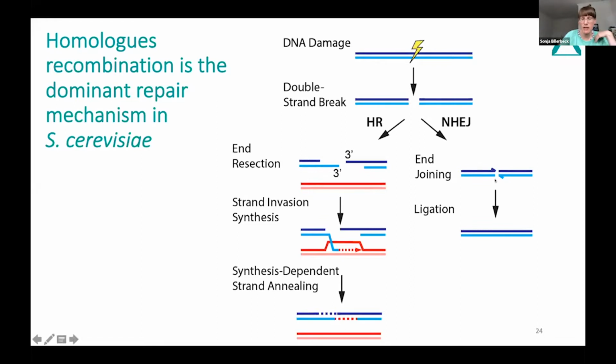And this is of course depicted here in the context of a genomic DNA recombination event. But we can harness that in the laboratory in order to join pieces of double-stranded DNA as long as they have homologous regions encoded at their ends. So bottom line, everything that we can do with Gibson assembly, we can also do in yeast just through its endogenous enzymes that are present.